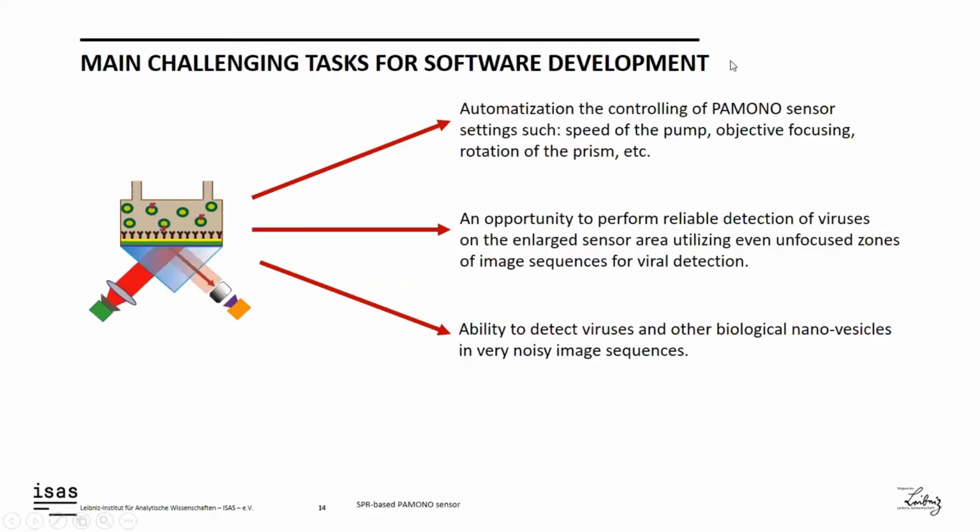And before my colleague Konstantin Wüstefeld will continue our joint lecture, I would like to mention challenging tasks which appeared during software development for the PAMONO-sensor. First of all, we would like to perform automatization, the controlling of PAMONO-sensor settings, such as speed of the pump, objective focusing, rotation of the prism.